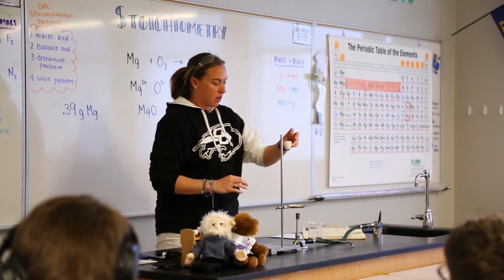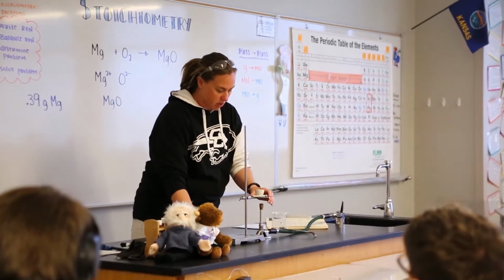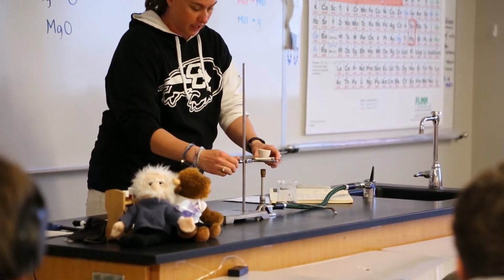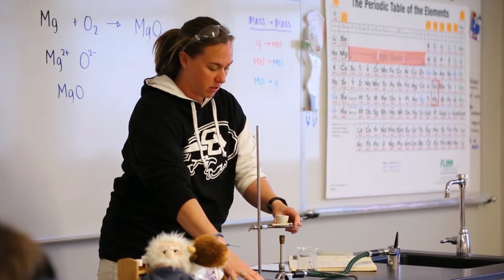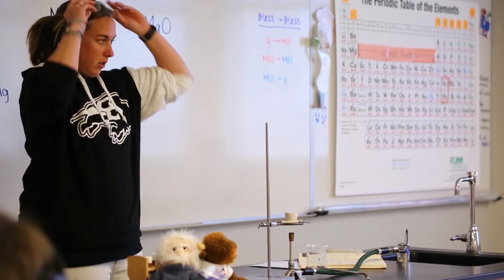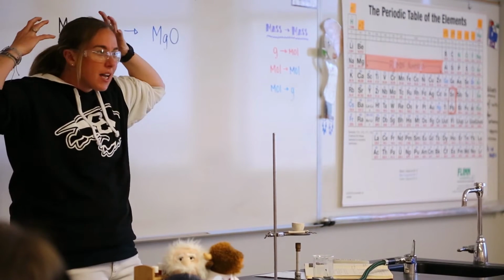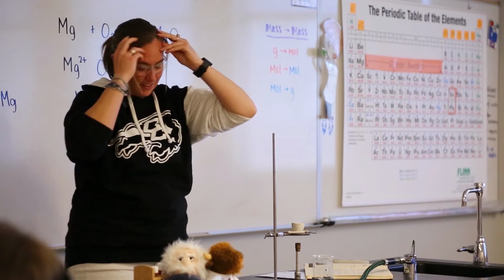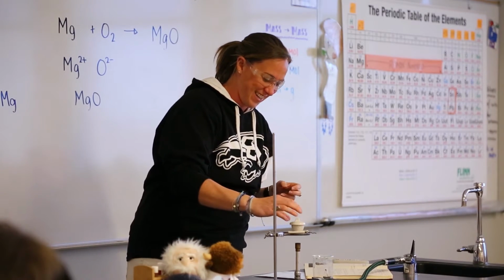And we're going to stick our crucible on a clay triangle. Clay, again, for the same reason, it dissipates heat. It will help it heat evenly throughout. Goggles, right? Safety goggles always. Hair tied back because it's heat, fire. As much as some of you probably want me to catch on fire, we're not going to do it.